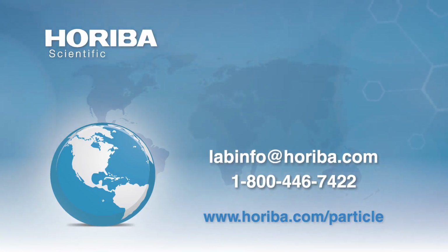Thank you. Okay, so next question, how do we measure the zeta potential of dry powder, say illite? Well, the zeta potential really only develops when you've got a surface of shear because you've got liquid present.